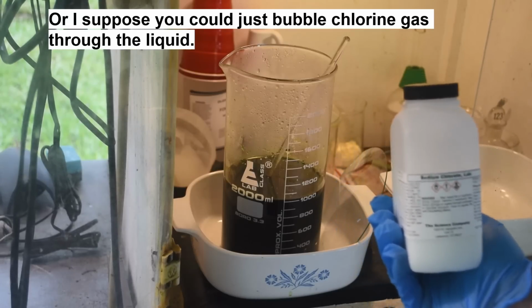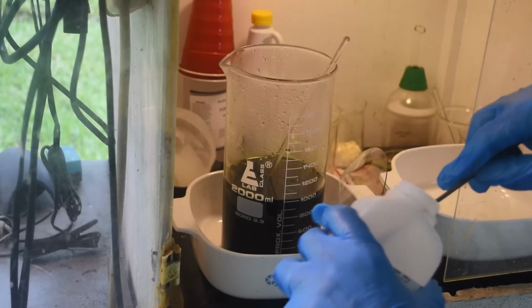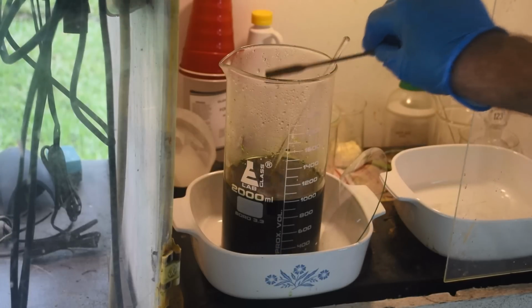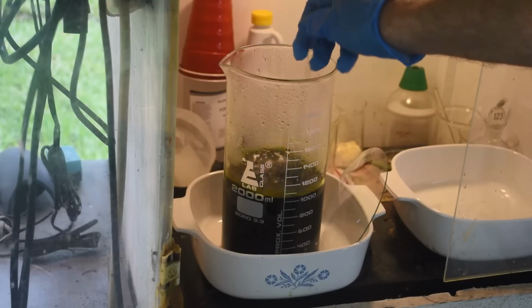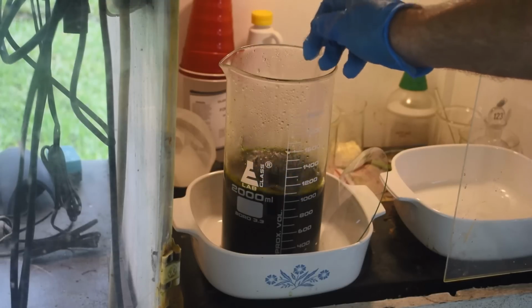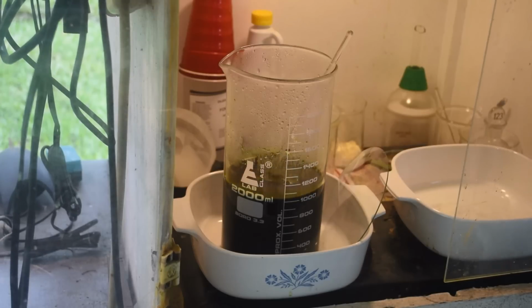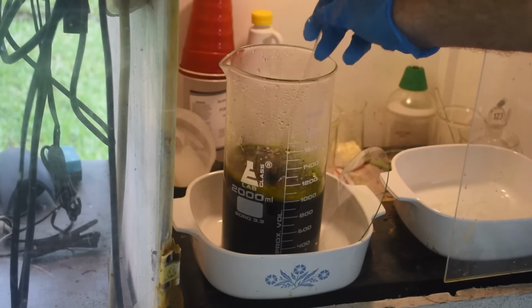So we're just going to put a little bit in. A little bit at a time. Especially since this stuff's hot. The reaction can really take off. Yeah, see, we got some foaming going on there. That's pretty controllable so far.